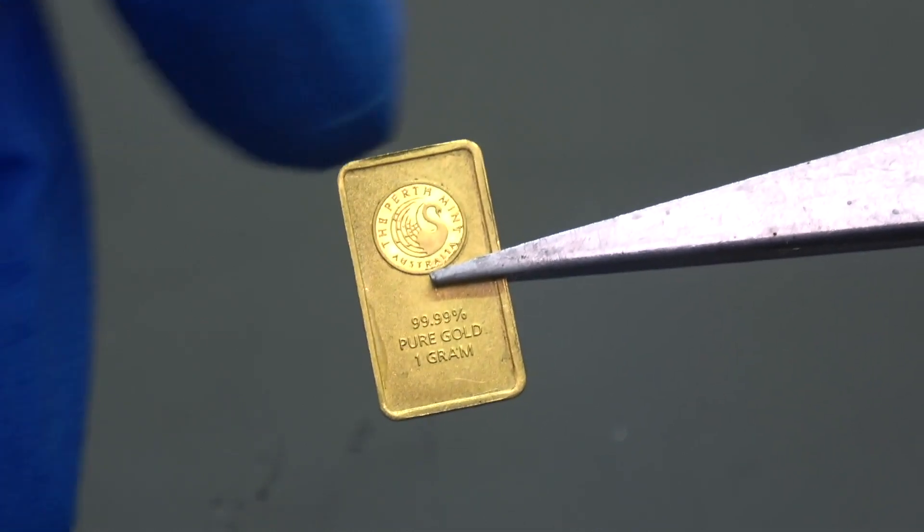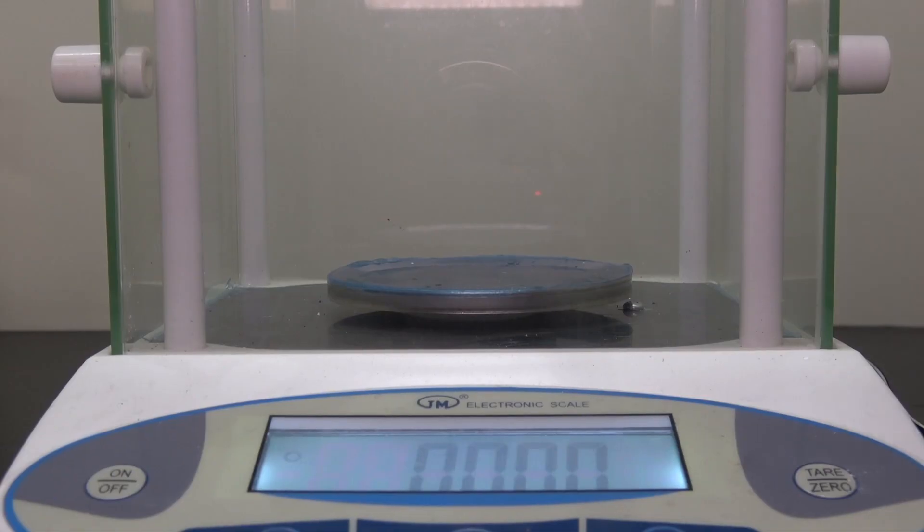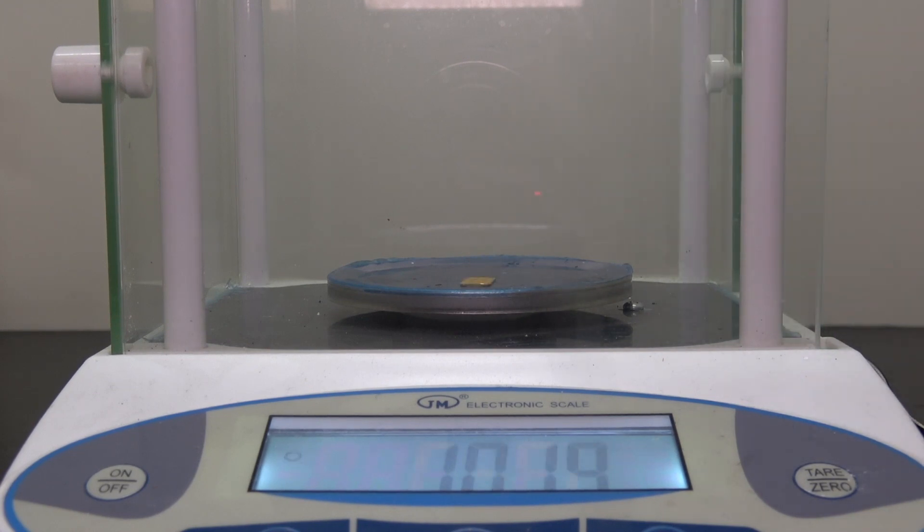Anyway, the gold bar is finally free from its imprisonment and ready for some abuse. Before we actually do that, let's weigh it first. That way we can determine whether or not there is a loss of mass. Looks like I have 2.1% more gold than I actually paid for. That honestly just made my day.